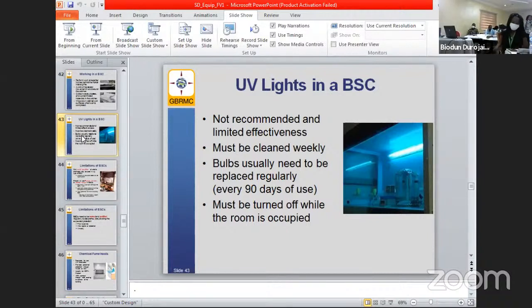So the biomedical engineers recommend now that even when you switch this on, you leave the room. Switch on the UV, and then leave the room. When it's time, then you come in and switch it off. That is their recommendation, based on robust risk assessment, weighing the UV risk and cost to the worker that is trying to work.